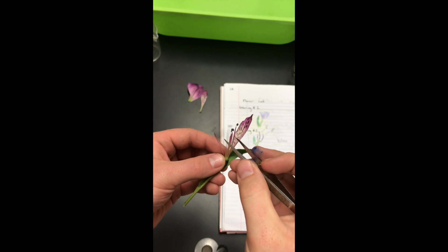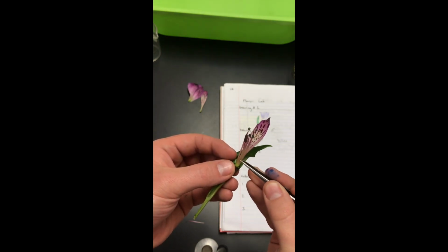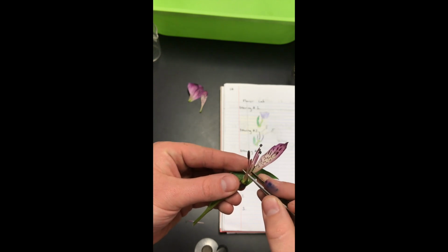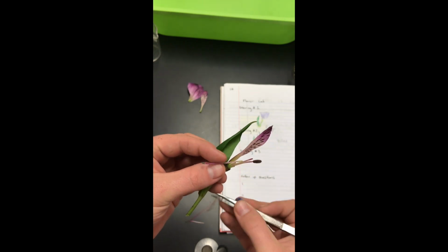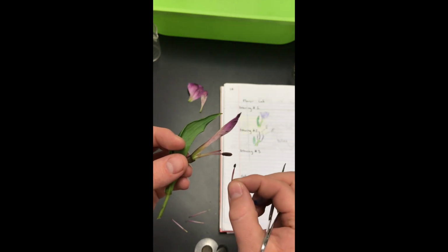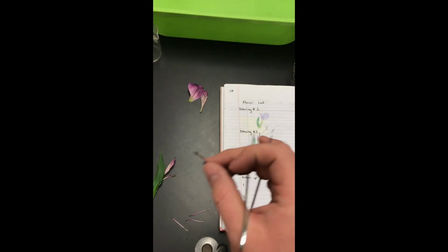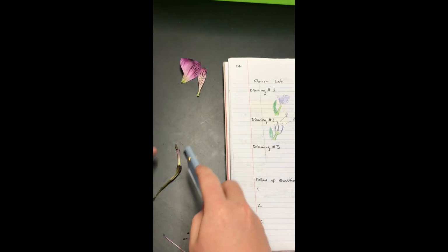And the third part here, or maybe I should say 2B, you are going to remove the anthers. So be careful to leave the style. I know they can be kind of tricky and they look very similar. So you can see there in my right hand I have a filament and anther. So I have the stamen. Some of you will be able to rub this on your paper and note the color of pollen. Others of you will not be able to, as I bought these from the store. In nature they would be a lot more prominent.